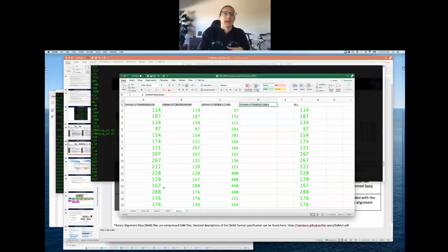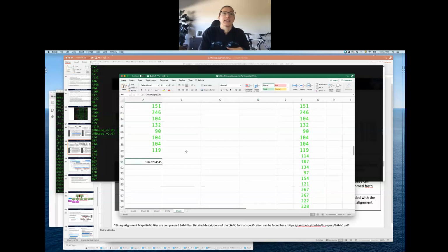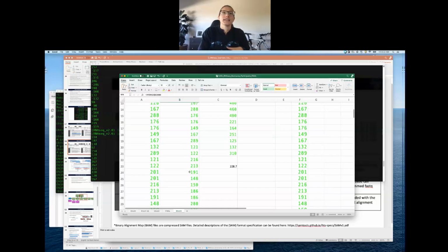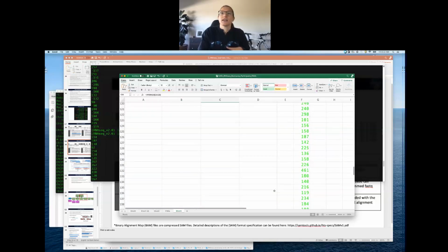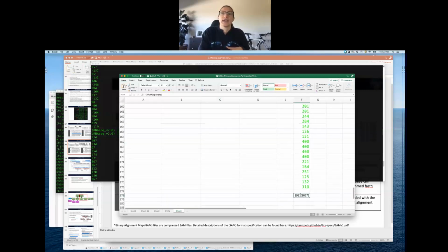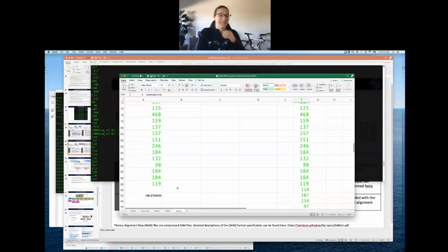And then I copy and pasted those fragment lengths and then just used the Excel function to take the average of each of them. I didn't know at first if this was also weighted based on isoform percentage, because I couldn't find any forms where that was clear. So I took the average of all of them too, and it turns out that didn't match the number. So that's how I'm assuming that these are also going to be weighted.